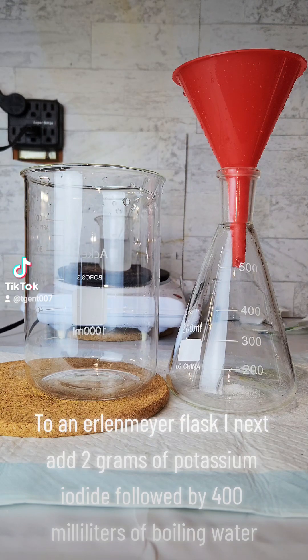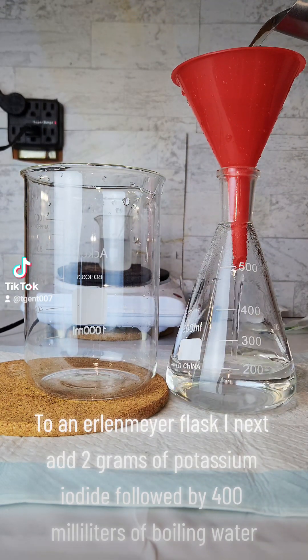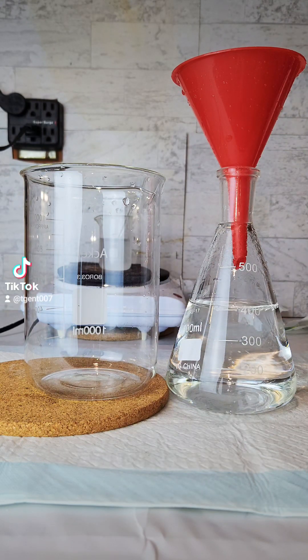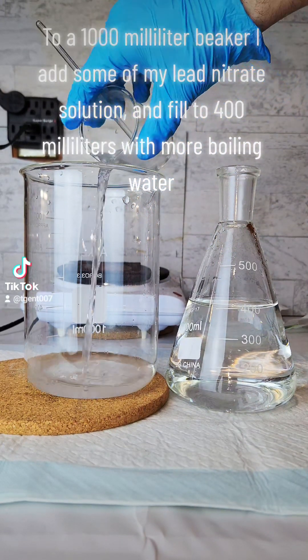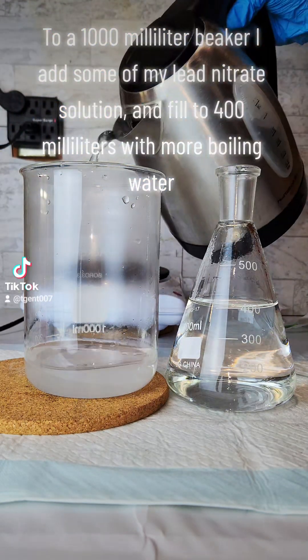To an Erlenmeyer flask I next add two grams of potassium iodide followed by 400 milliliters of boiling water. To a 1000 milliliter beaker I add some of my lead nitrate solution and fill to 400 milliliters with more boiling water.